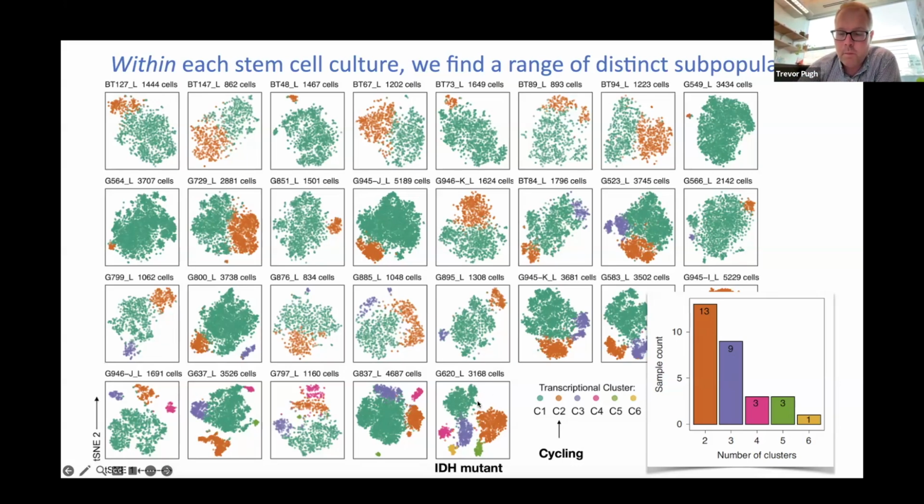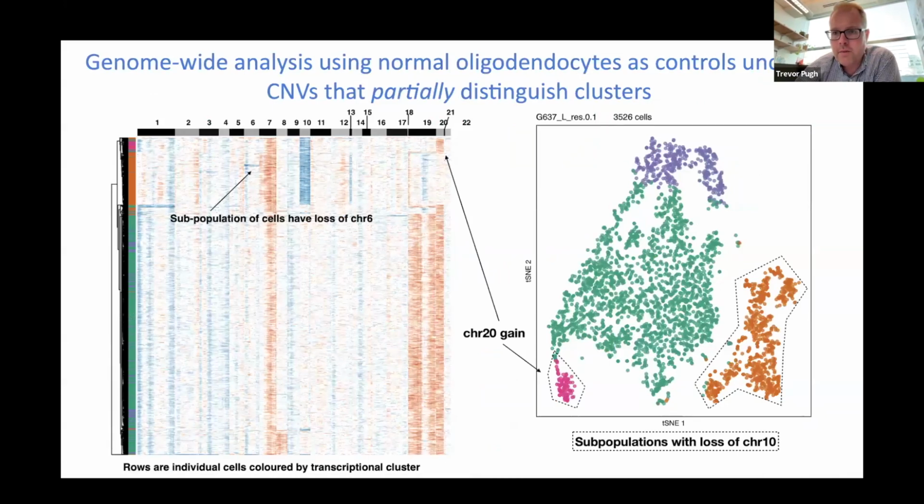So it really showed, with single cell sequencing, the ability to zoom in on exactly what's existing in these populations. We could also take that information and infer DNA copy number from the RNA sequencing data. So here you can look at genes that happen to be on the same chromosomal arm. The resolution of this, you can probably get down to a cytoband, but if you look across the entire transcriptome, you could see basically every single cell had overexpression on this arm of chromosome 7. So you scan all the way down. But then this subpopulation here uniquely had underexpression, or low expression, of chromosome 10. So, loss of a known tumor suppressor in glioblastoma.